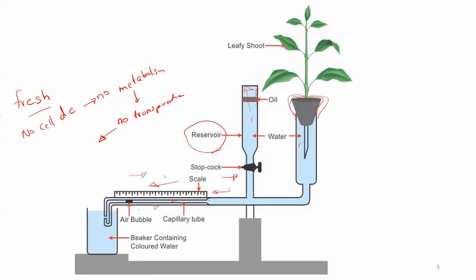Yes. Then in here we take one air bubble. If you go for 2 or 3 air bubbles, that also affects your readings. Only take one air bubble. Please consider that one air bubble only.